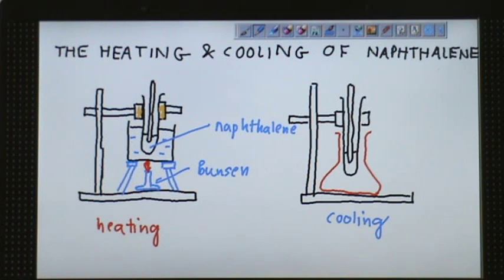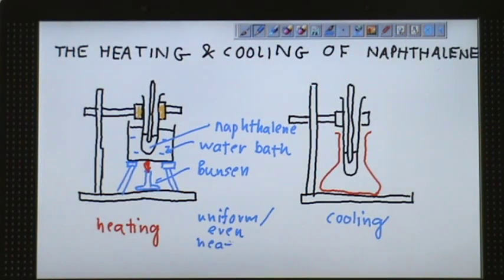This is the naphthalene substance that you put in. Make sure your thermometer is below the level of naphthalene, but the level of naphthalene must be below the water level. We put water in the beaker, called water bath, to allow even heating or uniform heating.